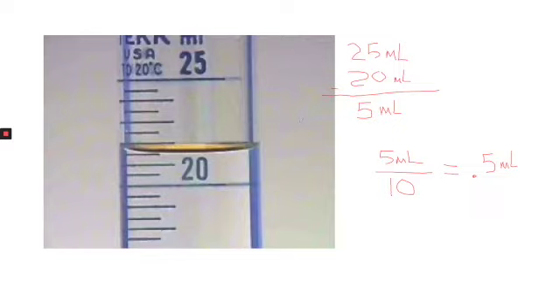I hope this helps you determine subgraduates on the science tools we're going to be using in this unit. If this video wasn't good enough to help you figure out how to determine the subgraduates, please approach me and I will do a live demonstration with one of our graduated cylinders in class.